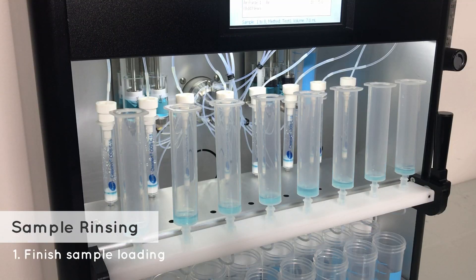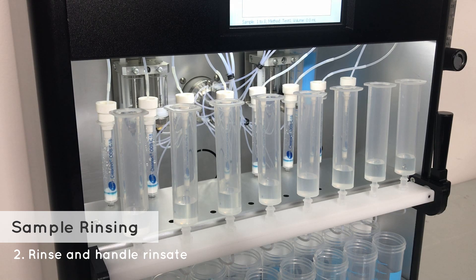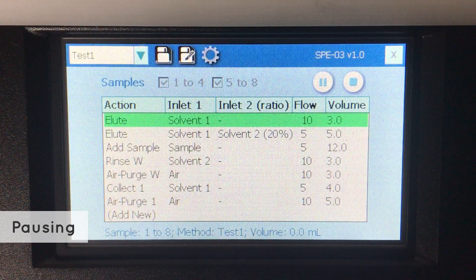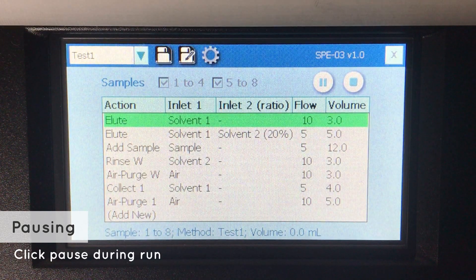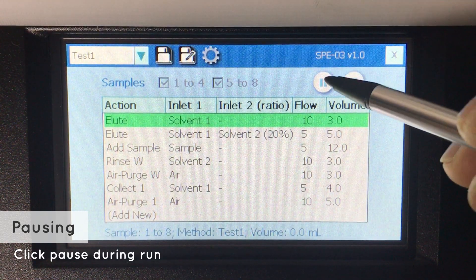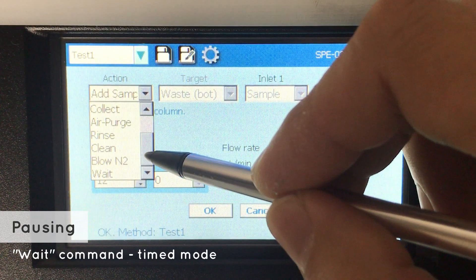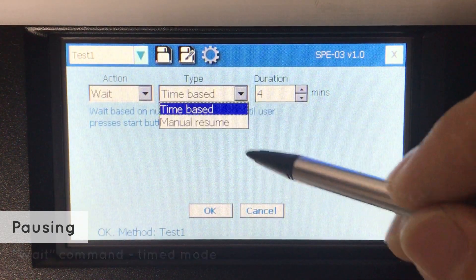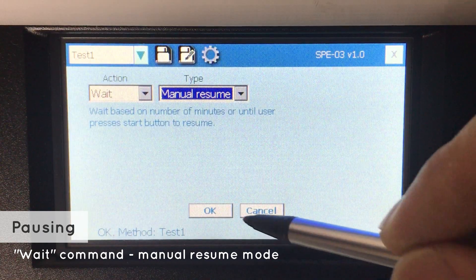Shown here is the rinsing step after sample loading. The rinsates can be delivered to the fractions or waste. For cases that require the machine to pause — such as to manually add internal standards — users may push the pause button or add a wait command to their methods. The program will wait for a specified duration or until the user presses start to resume.